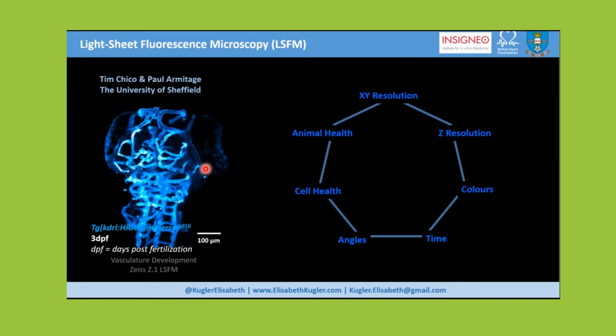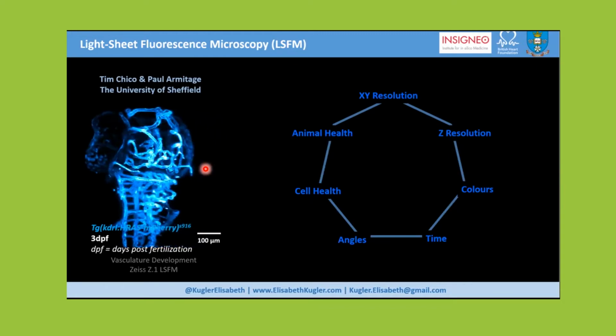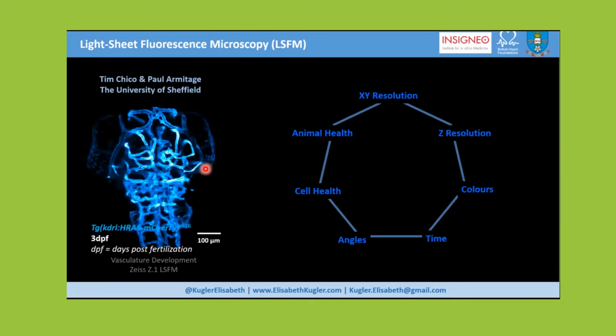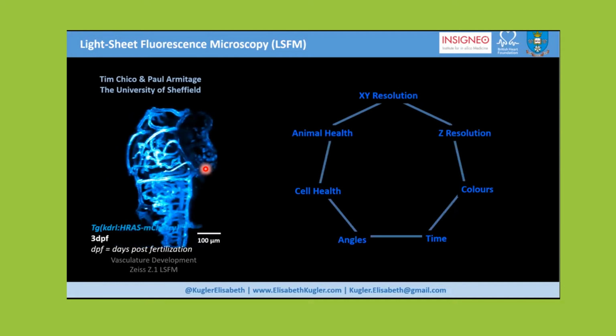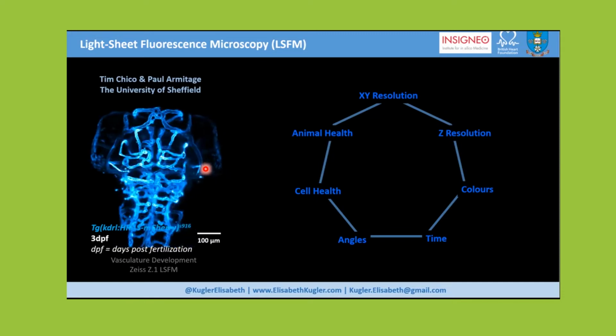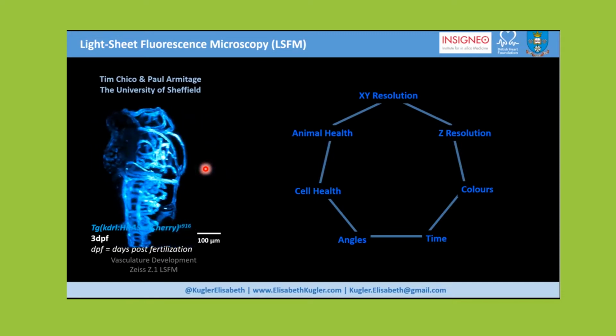vascular development. And once I understood the acquisition, I then said, okay, now what we want to do is actually quantify the vasculature automatically and produce this software. But actually, it is very, very challenging if you don't know at the very start if these fish would be comparable at all whatsoever.